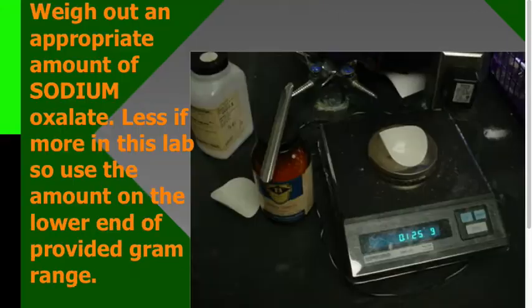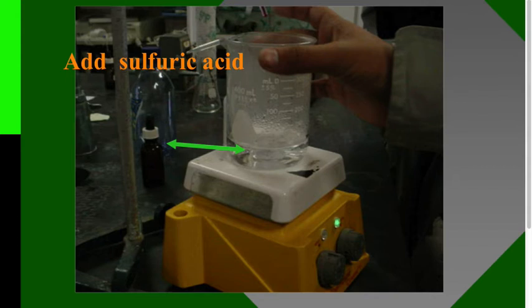You're going to weigh out an appropriate amount of your sodium oxalate—it's sodium oxalate, not the potassium oxalate you used when you made your crystal. Less is more here. Whenever you're given a range in this lab, go toward the lower end because it'll take less time to titrate. You're going to dissolve it in water.